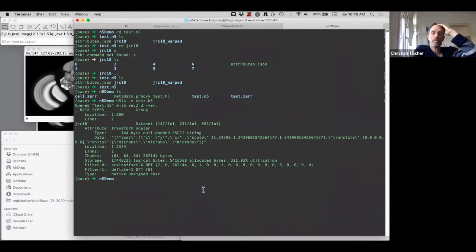And what's the problem with it just being a big string? I don't know. At least it would be 100% the same as in the other one. And that is how it lives on disk. The file system doesn't validate that your JSON list doesn't contain a string. On the file system, it's just a bunch of bytes, and in HDF5, it would be just a bunch of bytes.